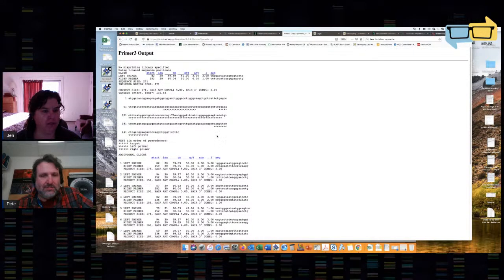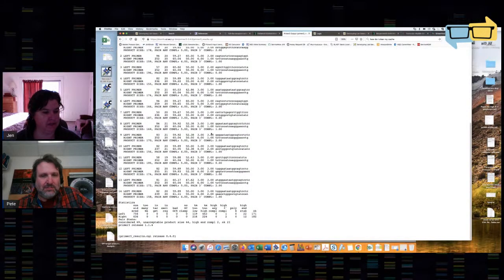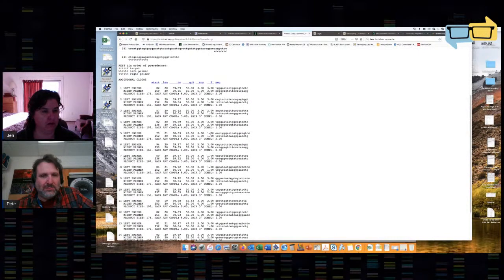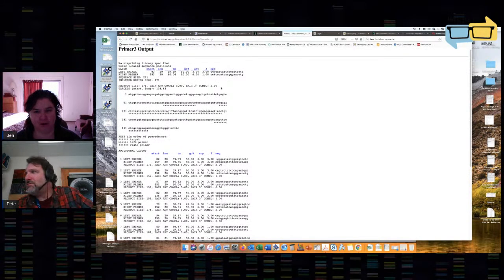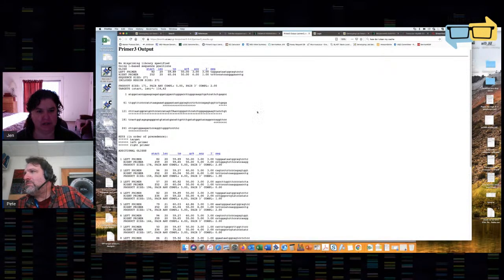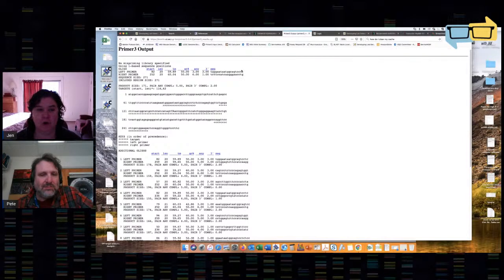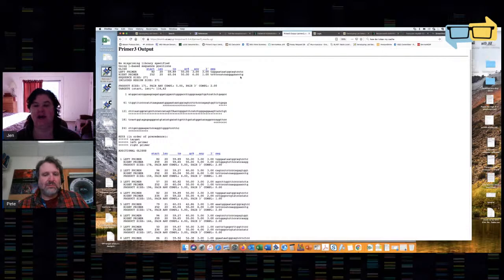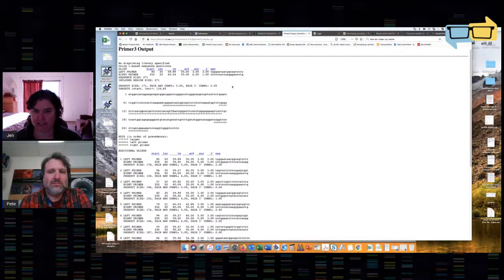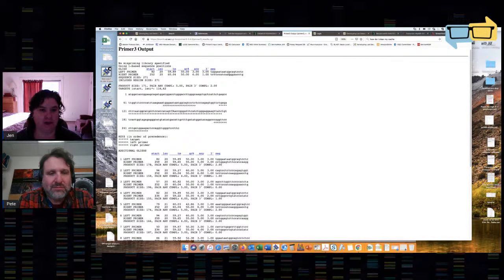Now I'm going to pick my primers. Primer3 has given me the 15 sets I asked for. I don't think they're in any particular weighted order, so it's just as reasonable to use set 1 as set 15. What I do like to look for is a C or G in one of the last two nucleotides of each primer — that has to do with hydrogen bonding. I just like to have the 3' end of the primer very tightly bound. I like both of these because they both have that.